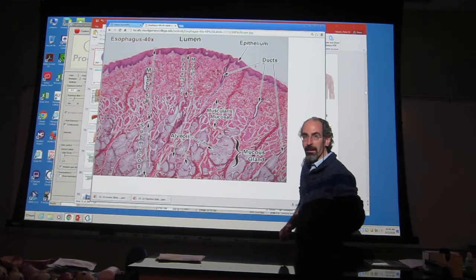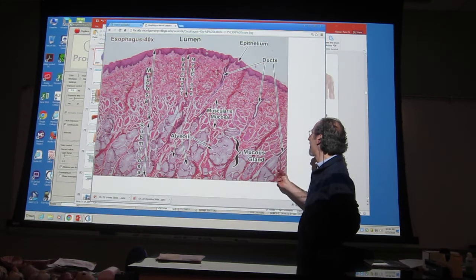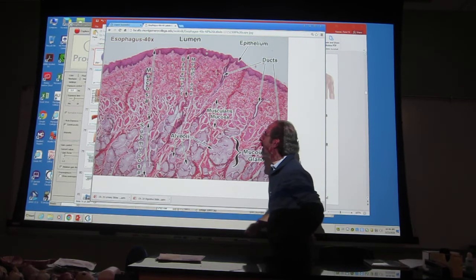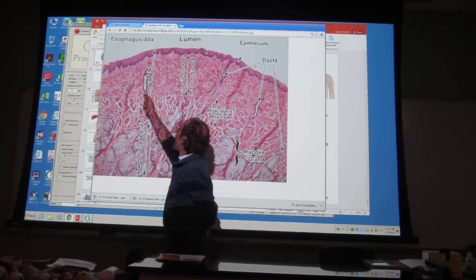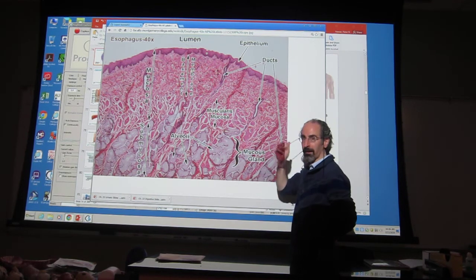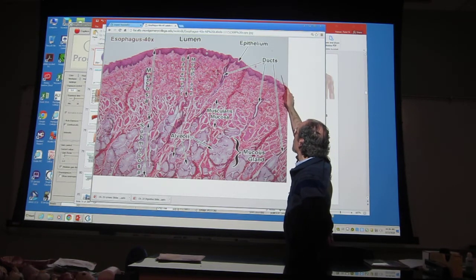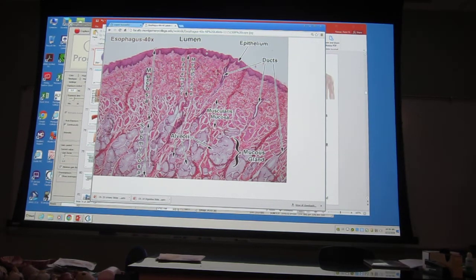Do you see another duct on this slide? Oh, well, okay, yeah, I can see labels from here and here, but there's even another one which is unlabeled, maybe two. Good, there's one here, and there's another one here. This is a nice slide in terms of, he shows lots of ducts. Not all of the slides that you see will have such nice looking ducts sort of lined up in a row like this. And ideally, an even better slide, you would be able to see the duct connecting from the lumen back to the mucus gland. But since this is a thin slide, this is pretty good.